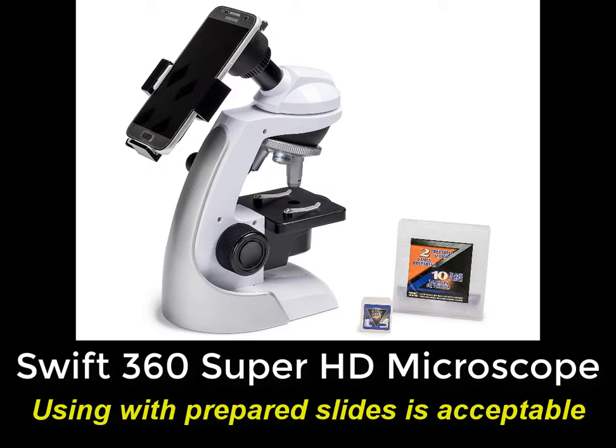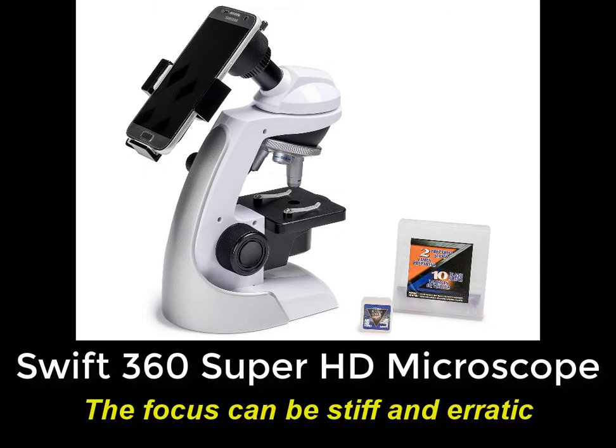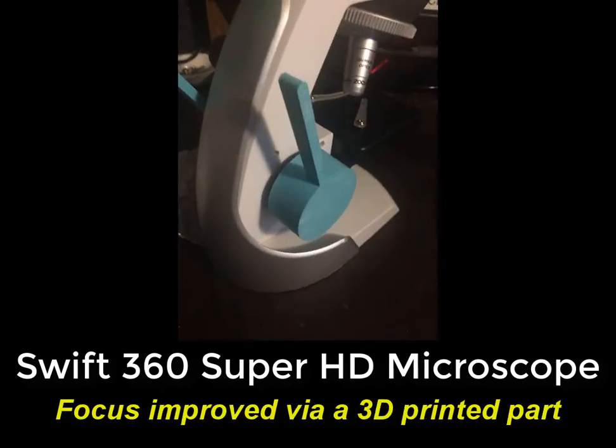If the primary use is going to be to view prepared slides, then not having a mechanical stage isn't a big deal. But with moving objects like protozoa, it's definitely difficult. The very stiff focus is my least favorite aspect of using this microscope. But even this can be improved with a little help from a 3D printed part, and I'll upload the file to Thingiverse.